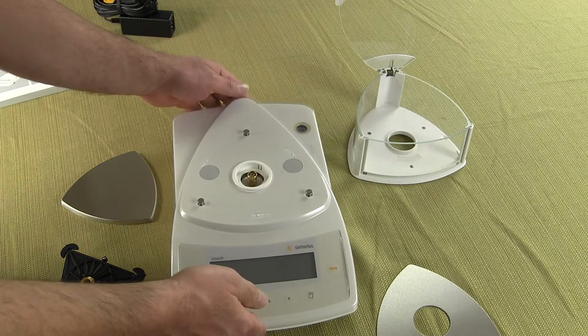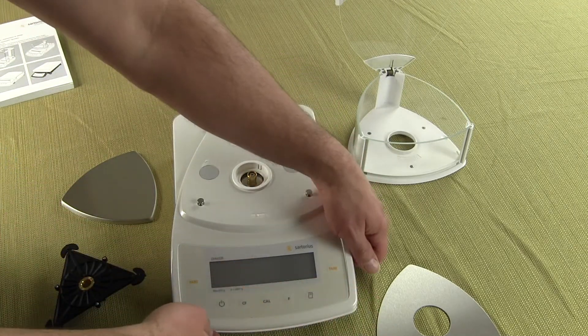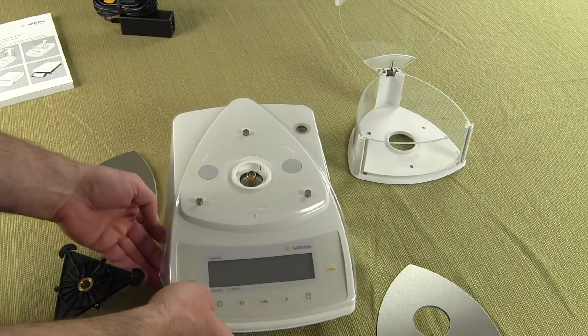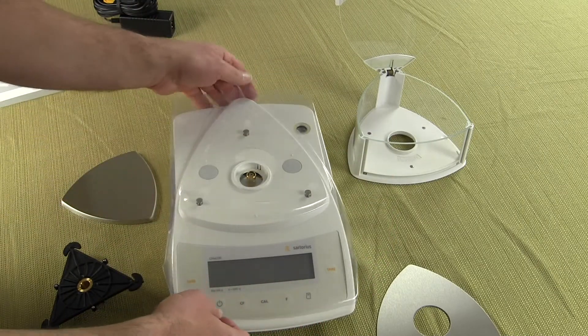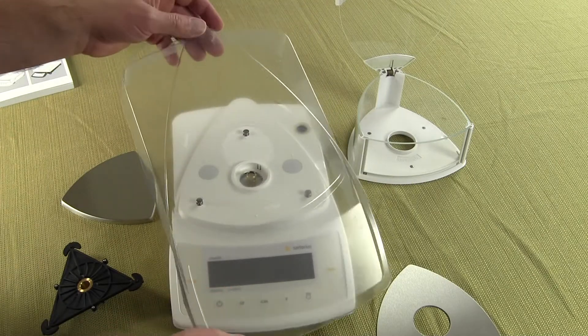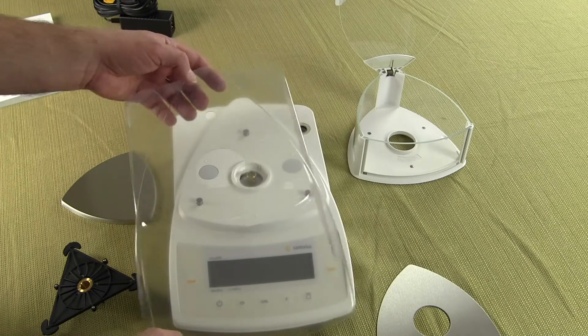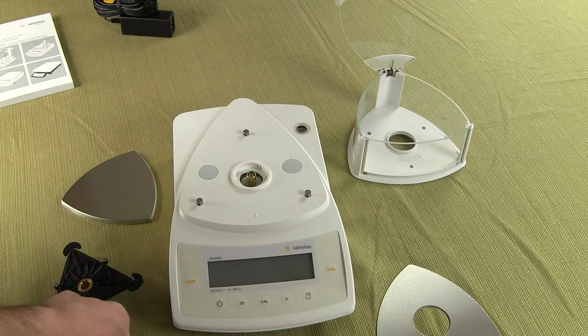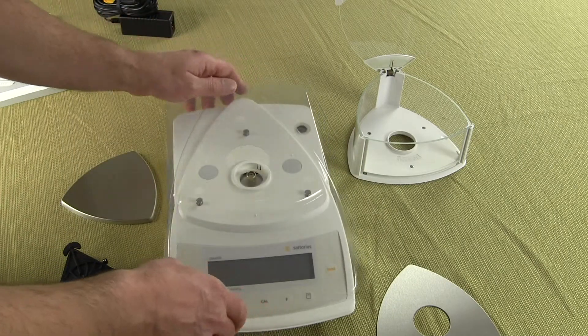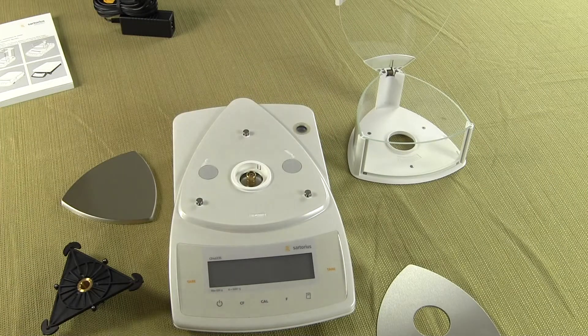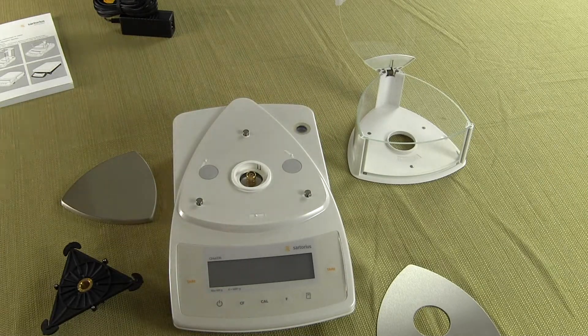The other thing you will get is one splash shield on this balance and you can buy more of these from Sartorius. So you do get one splash guard on the balance. So let's show you how to set up the balance. There's your splash shield and the first thing you want to do is power up your balance.